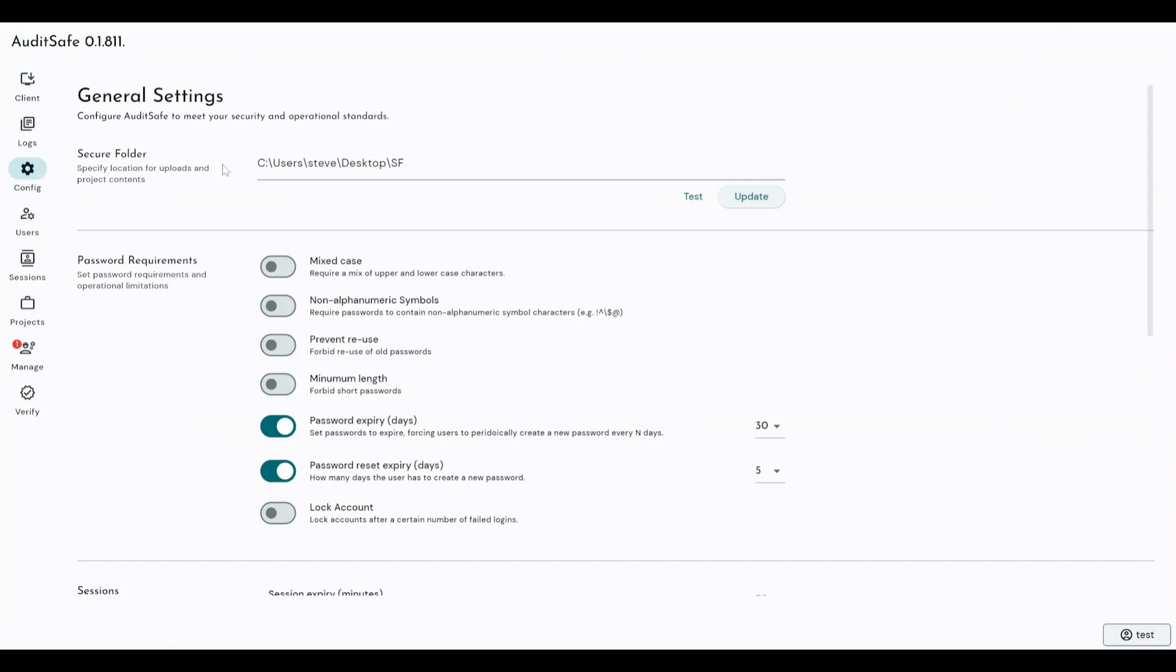Next, we've got the general settings that make up how Auditsafe functions. Now, the secure folder location, the secure folder is where all of your projects are stored when they're not being actively worked on.